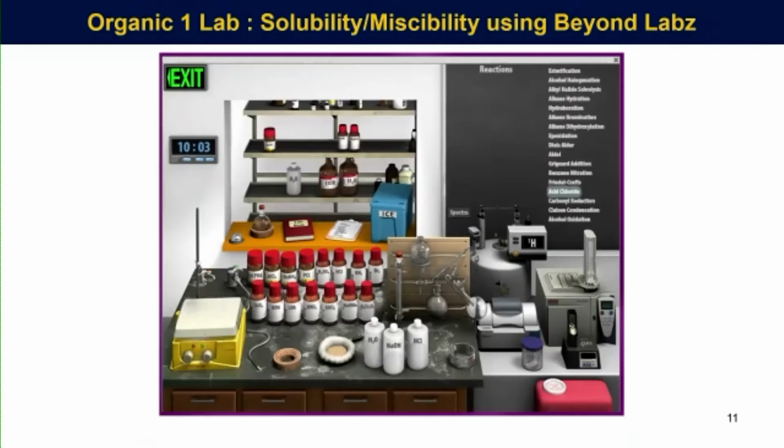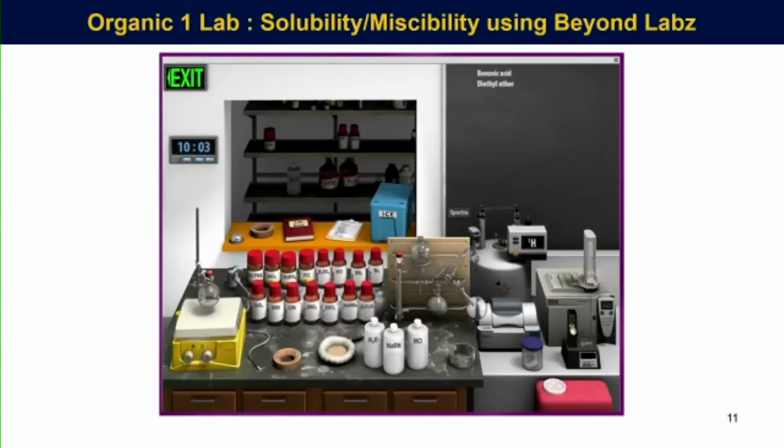They can't visualize where things are if both the layers are colorless. So this worked very nicely. Again, they had to think about why a salt goes into the aqueous layer, even if it's an organic compound.